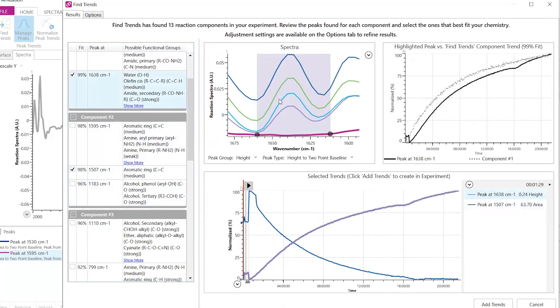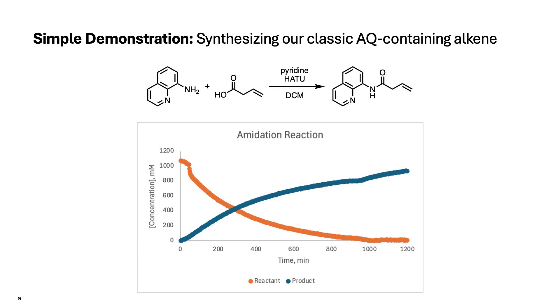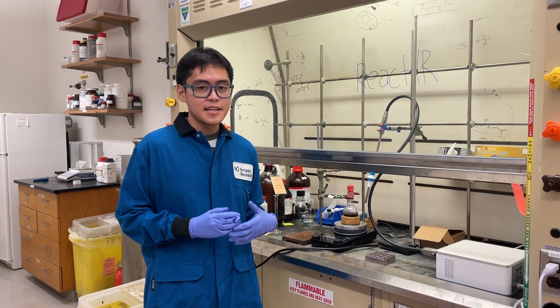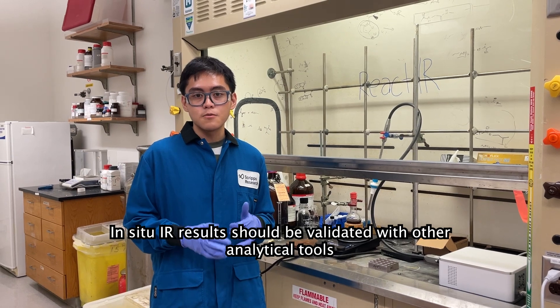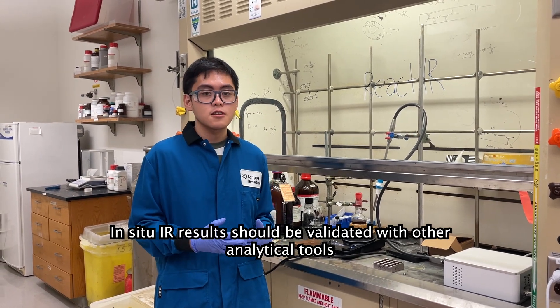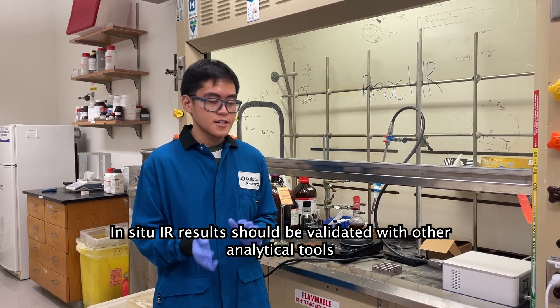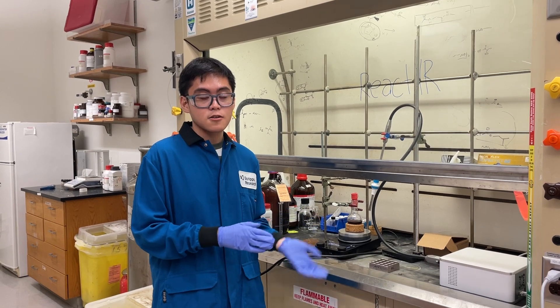We'll try to export this, and then after some data treatment, we'll look at how good a temporal profile we can get from this instrument. One thing to keep in mind is that it might be best to have analytical results or even other in-situ monitoring results such as reaction calorimetry to see if your IR results are consistent across the board.